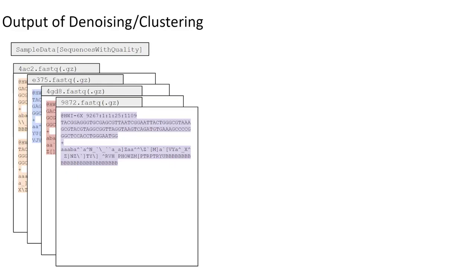Picking up where we left off from the last video, after importing and demultiplexing our sequences, here we have a sample data artifact which contains a series of per-sample FASTQ files. Following the denoising and/or clustering step, which we will discuss in more detail in a bit, we will be provided with two new very important artifacts.